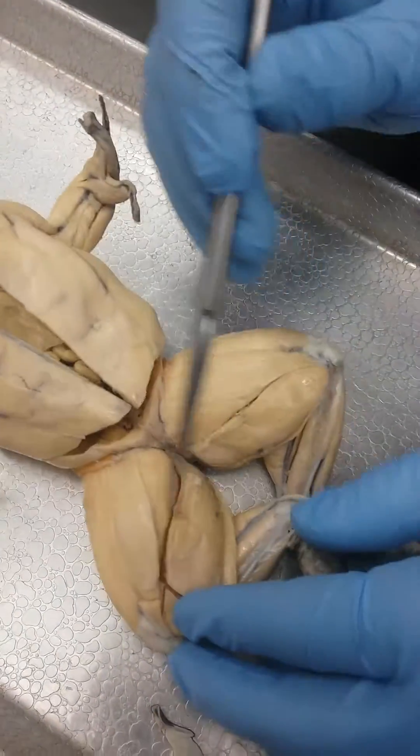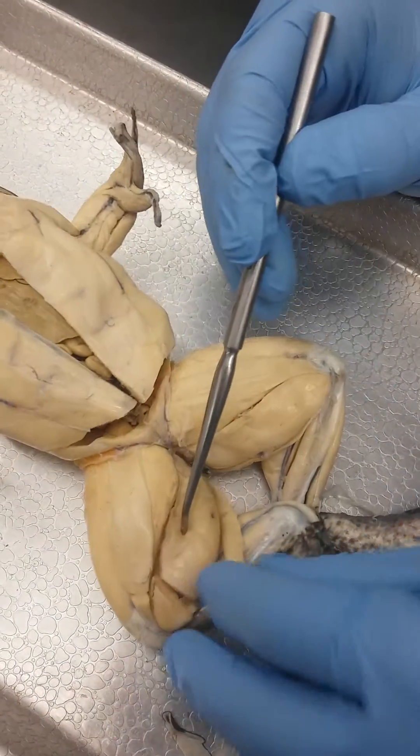This is gracilis major. So to summarize: sartorius, gracilis major, gracilis minor.